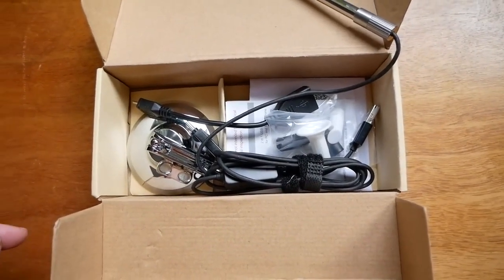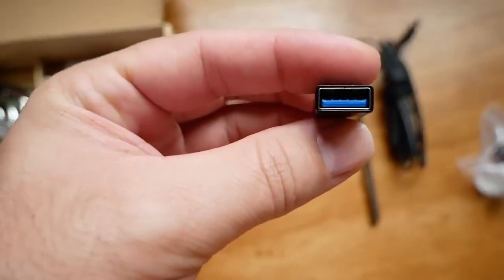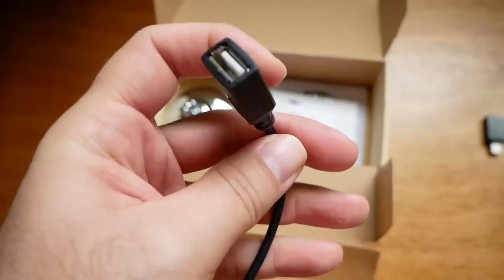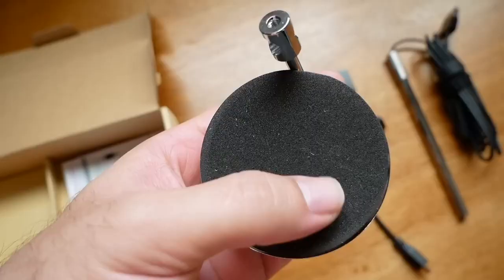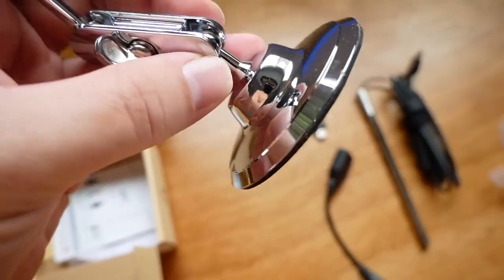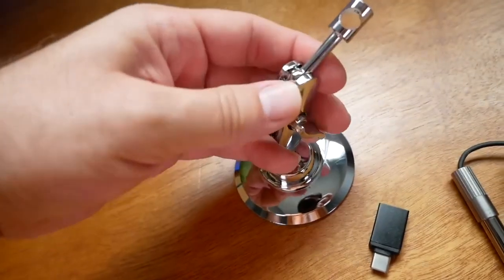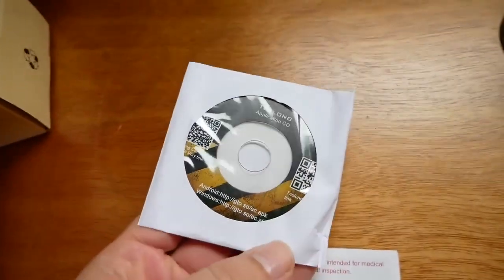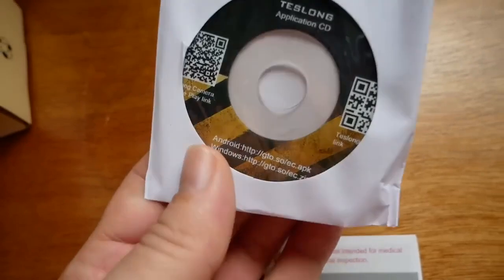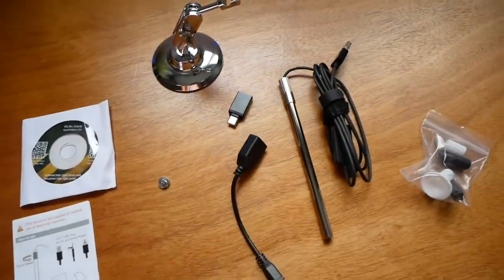Here we can see all the accessories that come with it. You get a scope with a decent amount of wire, some attachments for the scope, a USB to USB-C adapter, and a USB to micro USB adapter. There's a stand — it's a pretty nice one with a foam pad on the bottom, finished in chrome, all metal. There's also a manual and a little CD application, so if you're going to use this on the computer you could install the software to connect to the microscope.